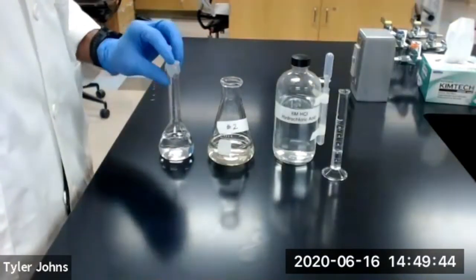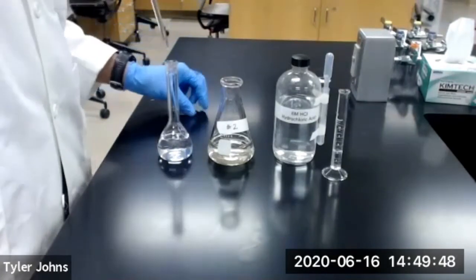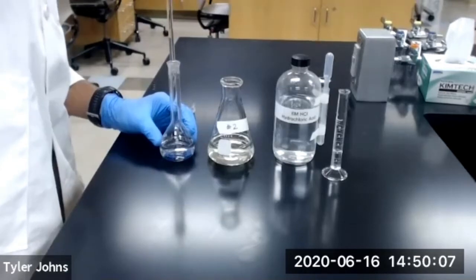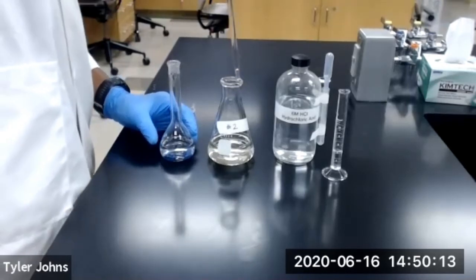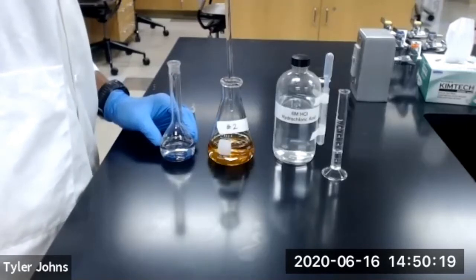And we're transferring 25 milliliters of our diluted bleach solution to Erlenmeyer flask number 2.